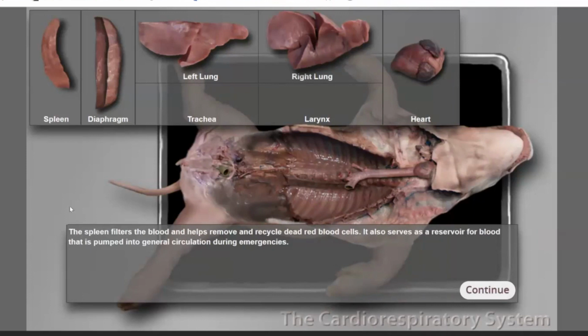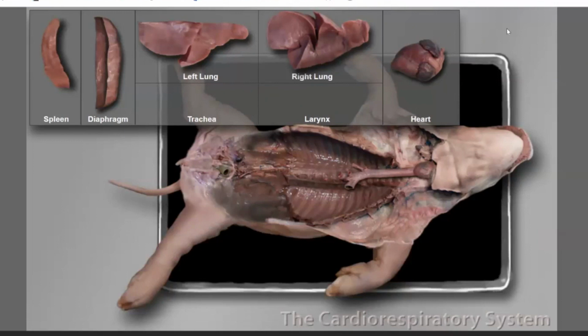If your spleen is enlarged, then if you, for example, are playing football or soccer or basketball or any high contact sport, and you get tackled, your spleen could rupture. It's just like a balloon, if you push it, it's going to pop. If your spleen ruptures, that can cause a whole lot of internal bleeding because, again, the spleen has a huge blood supply to it. So if you get mono, you're going to have to be out of contact sports for an extended period of time because we don't want your spleen to get enlarged, you get tackled on the field, and then have a major bleeding incident because your spleen ruptures.